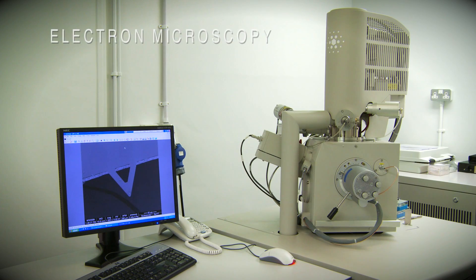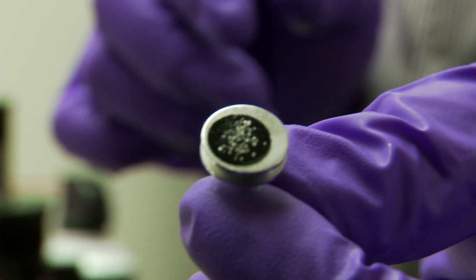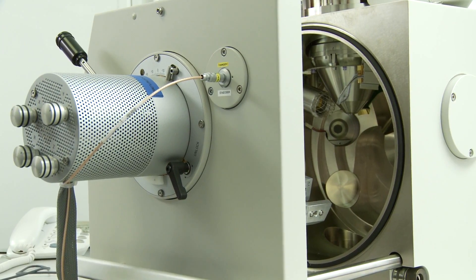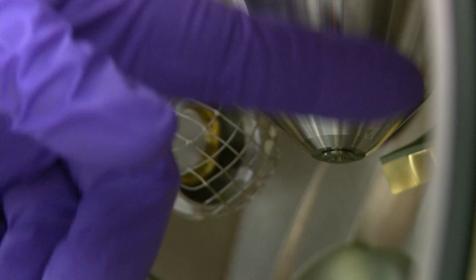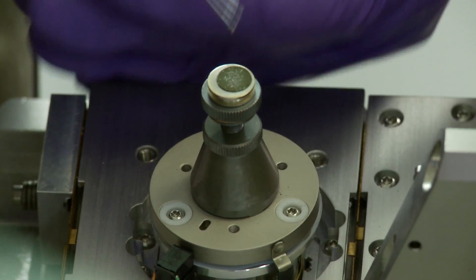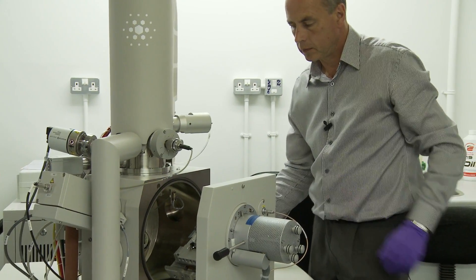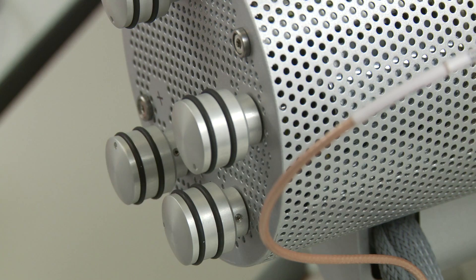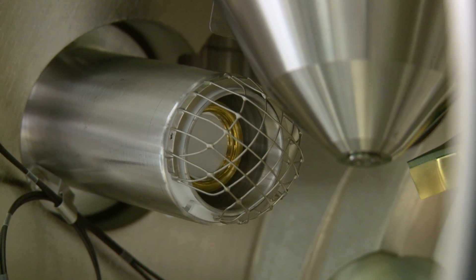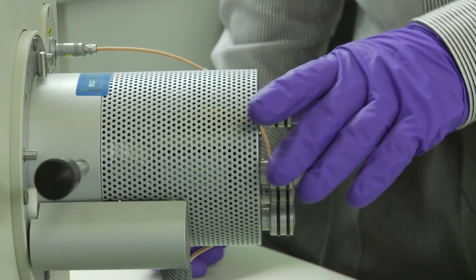A scanning electron microscope is a microscope which uses electrons for probing the surface of a sample. What you want is a replica of that surface so that when your primary beam electrons hit that surface, lots of electrons are generated. The electrons hit the sample, collide with electrons on the surface, giving off reflected or secondary electrons, which then hit a window and knock out a photon of phosphor — and what we actually convert electronically is a photon image.